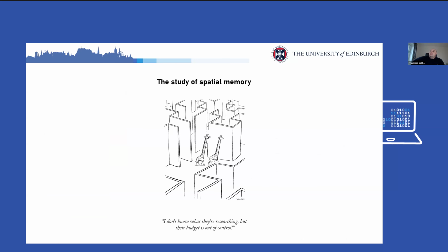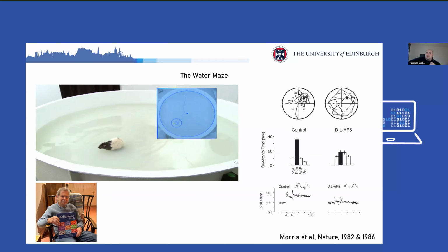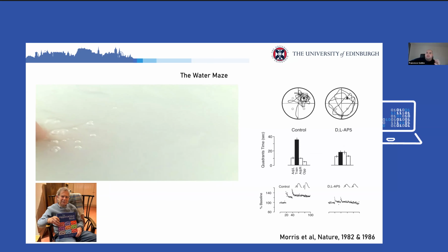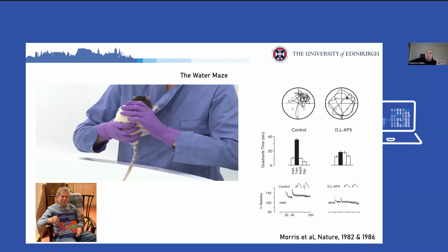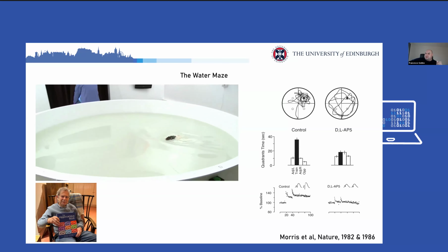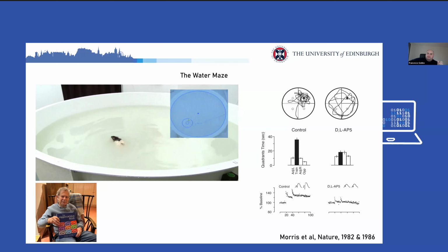So how do we actually study spatial memory in the lab? Essentially we use a lot of mazes. One of the most paradigmatic mazes is the Morris water maze. We run a number of learning trials where animals learn, for example, the position of a platform to escape from a two-dimensional water arena, and then they are tested on whether they remember the position, with the platform not being accessible or even visible to them.